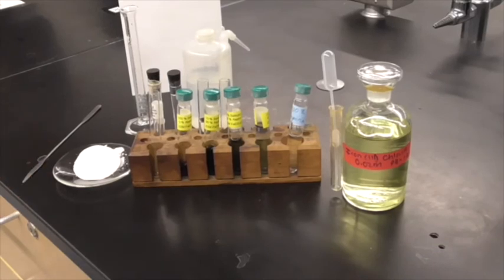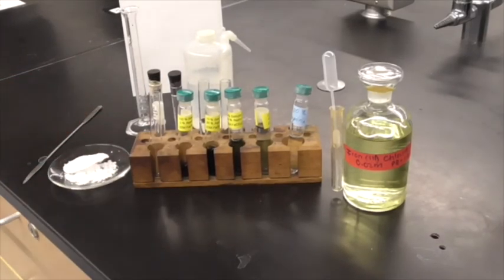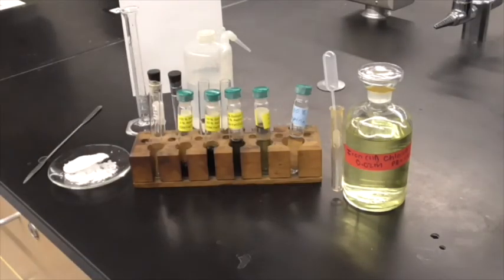All right, we're here to test the purity of our product. We've just got its mass. Now we want to see how pure it is. So what we're going to do is mix it with some iron 3 chloride. The reason we're doing this is that iron 3, when it's in the presence of salicylic acid, or the salicylate ion, will form a purple complex.